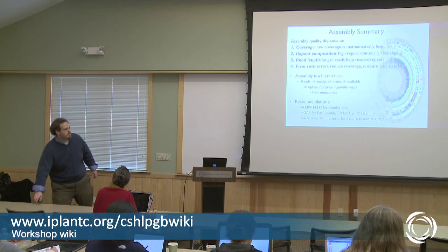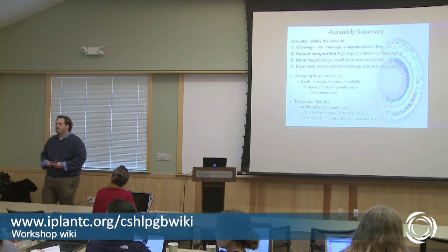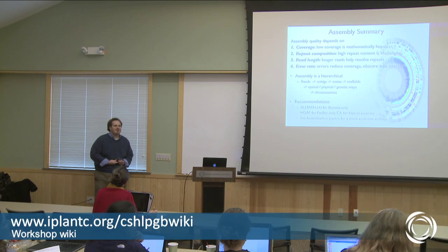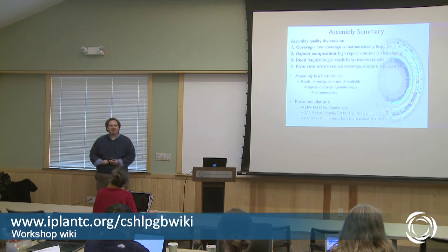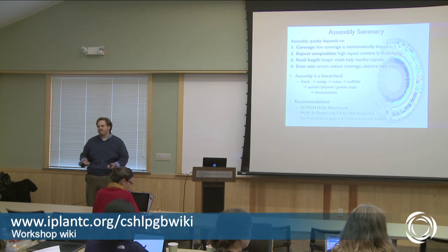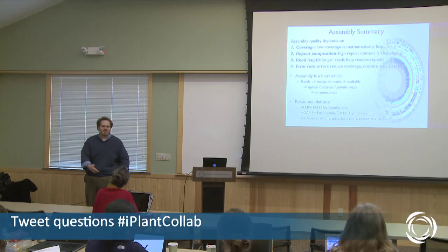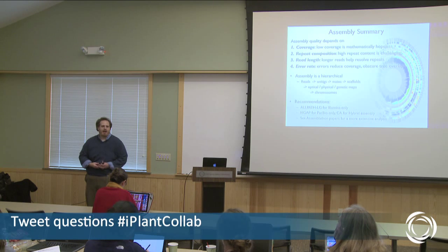So there are three online questions. Oh, sure. Okay, so the first question is, what's the best assembler for IonTorrent? Yeah, that's a tough question. We have an IonTorrent here at Cold Spring Harbor. It is not widely used because, number one, it's a different protocol, so it's complicated, in the sense that we have this really streamlined protocol for Illumina. We're not so streamlined for IonTorrent.